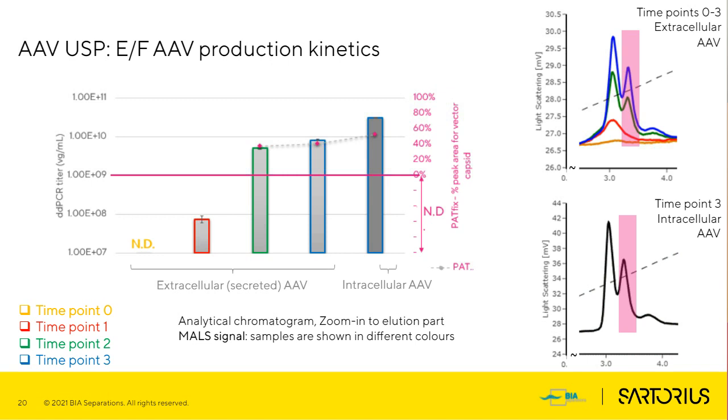We also saw that the titer in our cells is higher, but as I mentioned, what we plotted is titer, so it will depend a lot on how you dilute your cell pellet before you do lysis. If we diluted our cell pellet in higher volume, we could see, for example, this ddPCR value being much lower.